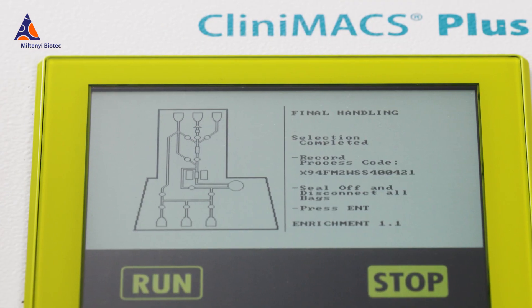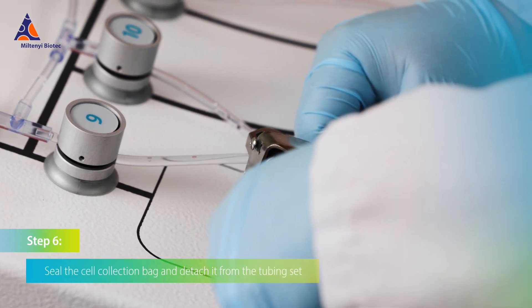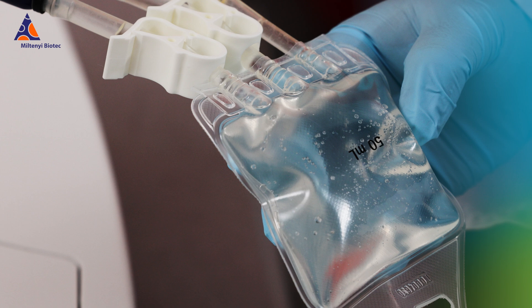Once your run is complete, follow the instructions on the screen and detach your cell collection bag from the tubing set. Now you have your purified target cell population.